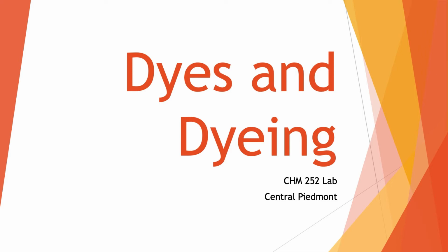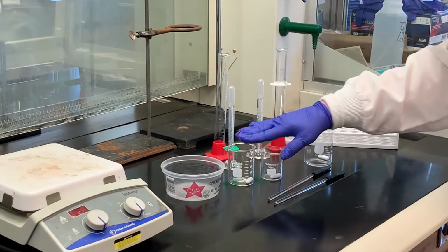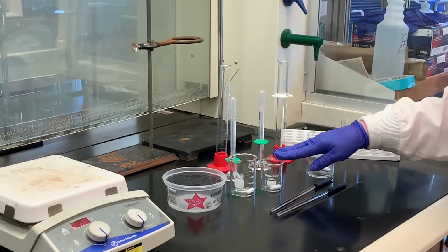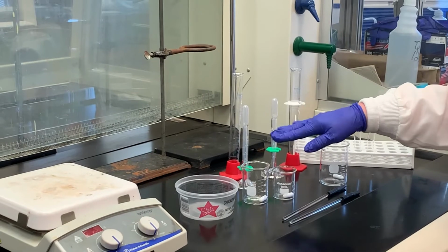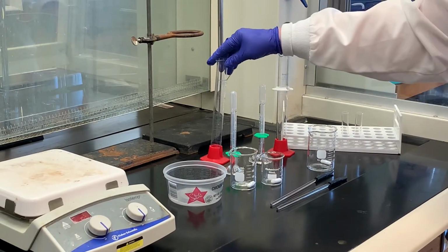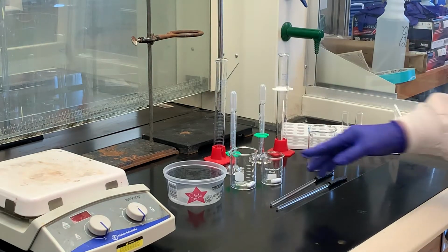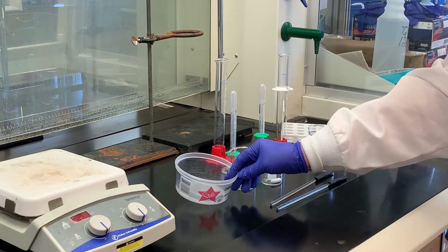Today's lab we're going to synthesize an azo dyestuff called Para Red, and it's kind of a two-stage process. We need to carry out a diazotization, and for the diazotization you'll need 2 small beakers equipped with stir bars. We'll need a couple of small graduated cylinders, pipettes wouldn't hurt, a 50 milliliter graduated cylinder or 25 for the diazonium salt. We need to chill that in an ice bath.